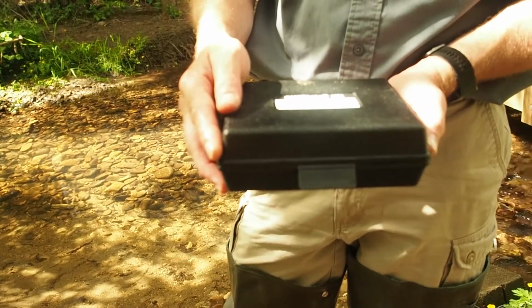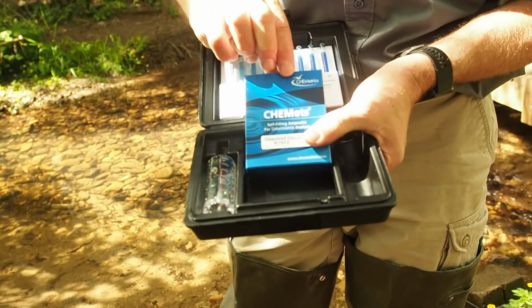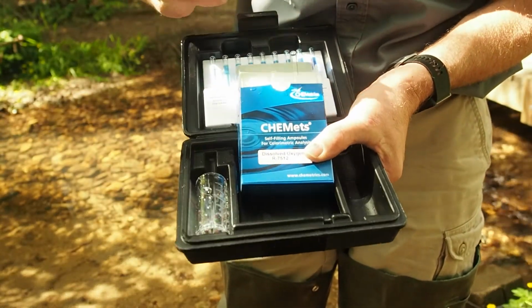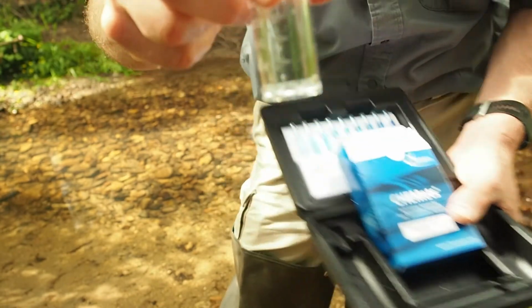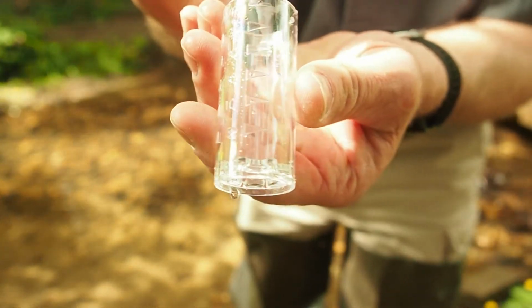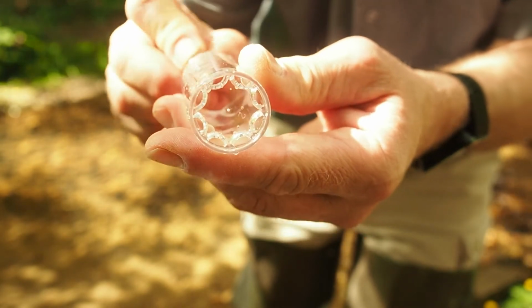IDAH2O uses a dissolved oxygen test kit containing small glass ampules manufactured by Chemetrix. Each ampule is a sealed vacuum tube with a pointed tip and a weakened point on the tip. The tube contains a small amount of liquid that, when mixed with stream water, reacts with the dissolved oxygen in the water to turn blue. The darker the blue color, the more dissolved oxygen in the water. The kit also contains a small plastic cup with indentations on the bottom.